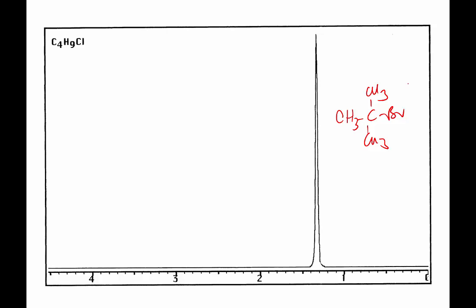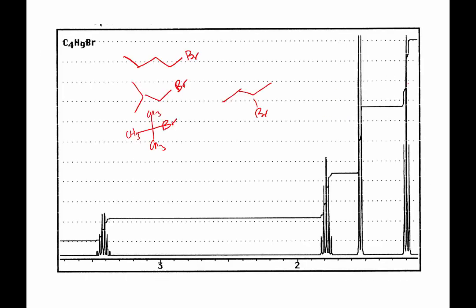Someone was correct that yes, that will have the lowest number of peaks. With 1, that's the least you can have. So there's spectrum 1, and we can take that one away because now that one's been assigned. How about sets of hydrogens in the remaining 3 molecules?